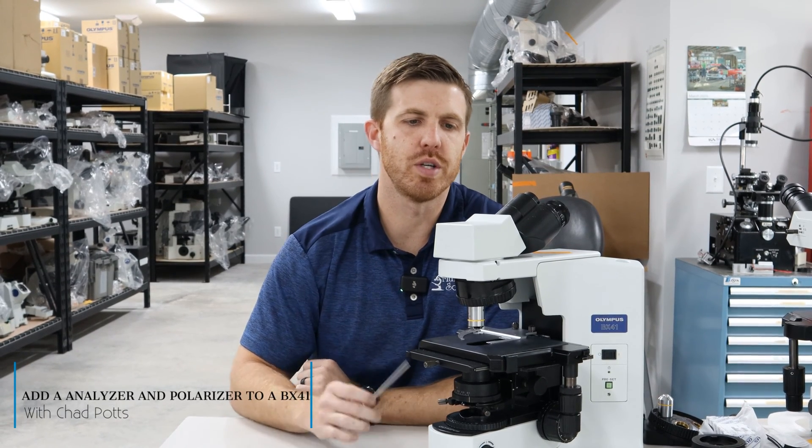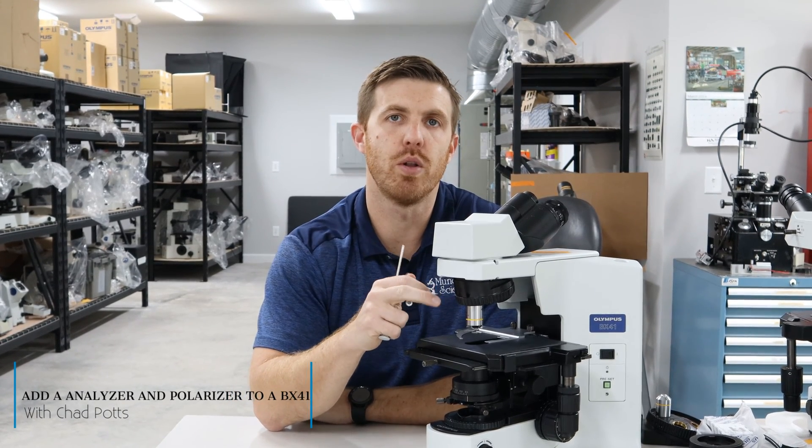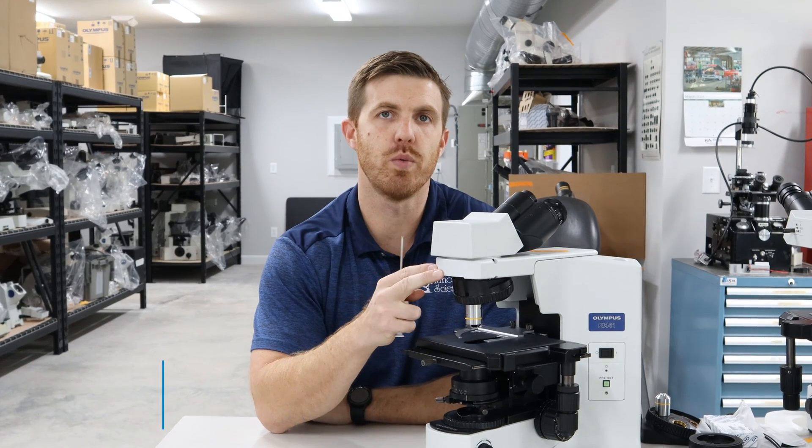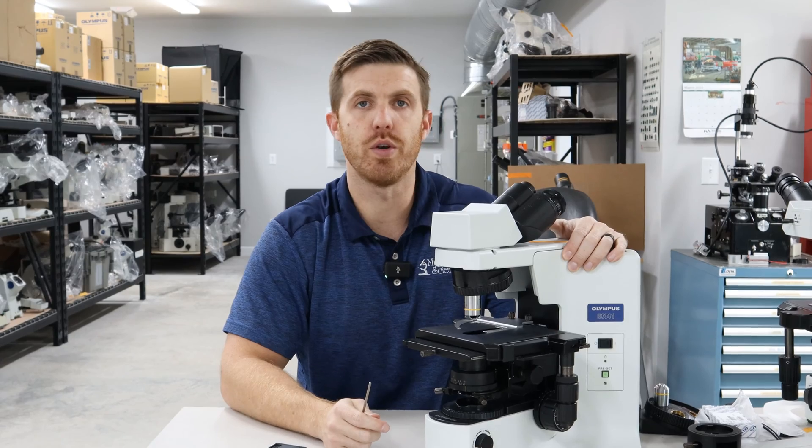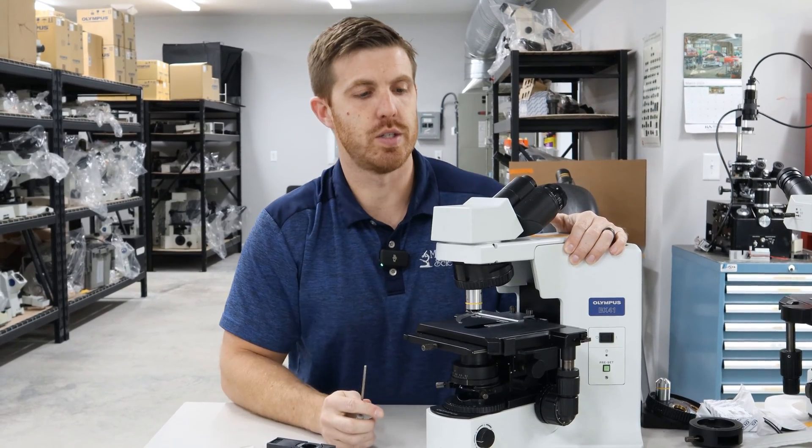Hey, this is Chad with Munday Scientific. Today, we're going to show you how to put an analyzer and a polarizer on an Olympus BX41 microscope. This procedure would be the same on the 51 or the 43, and so forth.